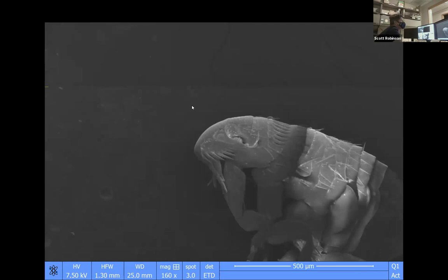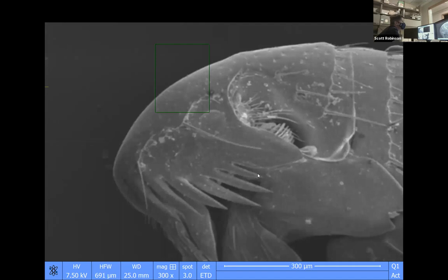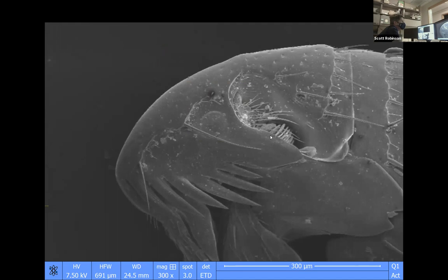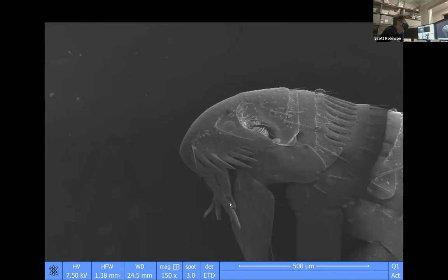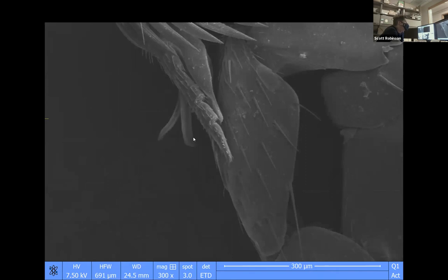And you can see there's an eye spot. They probably can't see very well, but they have a really small eye spot right there, and one on the other side. Behind the eye, it has a tucked in antenna. And on its face, it has these little spines that help it get stuck in your hair if they're in there biting you. And you can also see maybe part of the proboscis.